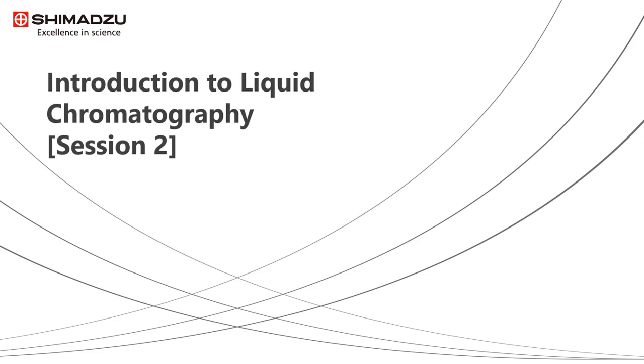Today's webinar will build on the knowledge gained during session 1. As such, today's session will explore different types of liquid chromatography, specifically how separation occurs. We will also touch upon other factors used to improve our separations.